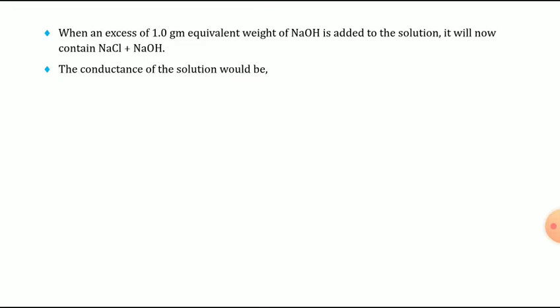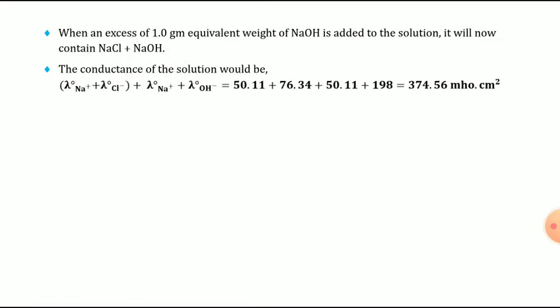Then the conductance of the solution would be, in the beaker or conical flask, NaCl plus NaOH.